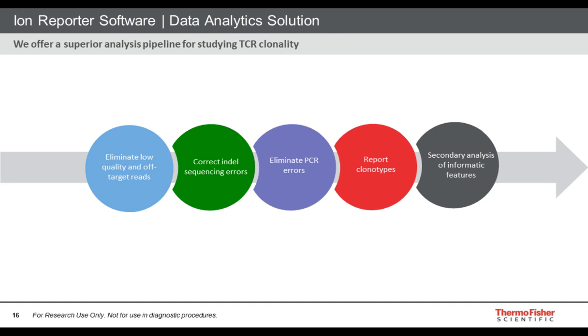Then lastly, we report out the clonotypes, and we have some secondary analysis exploratory features that I'll describe in the subsequent slides.